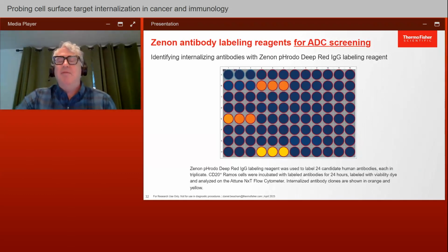And ADC screening, of course, is I think one of the most useful superpowers. I showed you that slide earlier of the 3 samples pulled out of a screen that Ryan did in triplicate, and it shows up quite readily over background, and we've got some nice work in process now with some collaborators looking at Z primes of this activity and so forth.